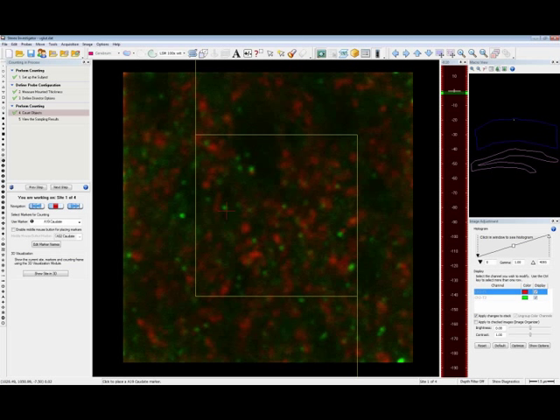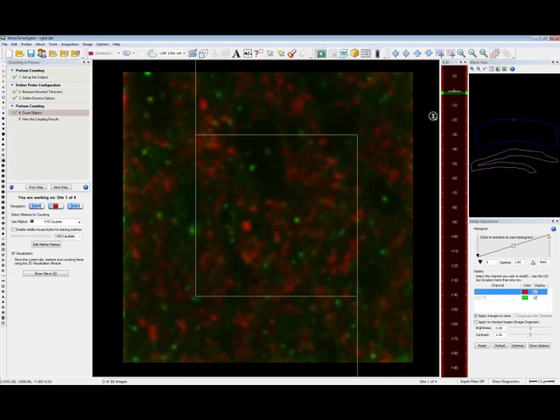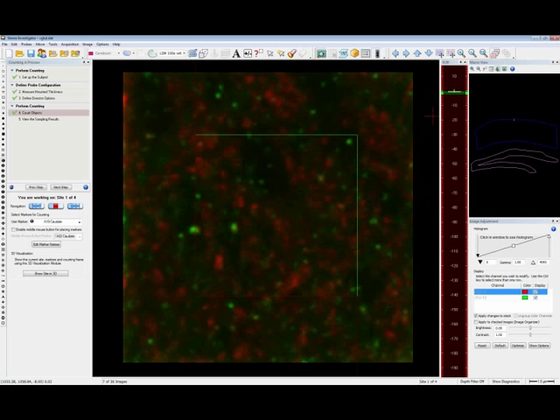And so this image stack, or these image stacks, were acquired at 100x with a zoom level of 5. And so we're looking at very tiny objects here, obviously. And as we mentioned before, all of that scaling information is shared between the two pieces of software seamlessly. Yep. And so now the process of counting is the same as if you were counting something very large like somas. You're going to move down through the image stack using the Page Up or Page Down key. And when you enter the dissector, you can see that the counting frame now becomes green and red. And we would mark objects as they appear.